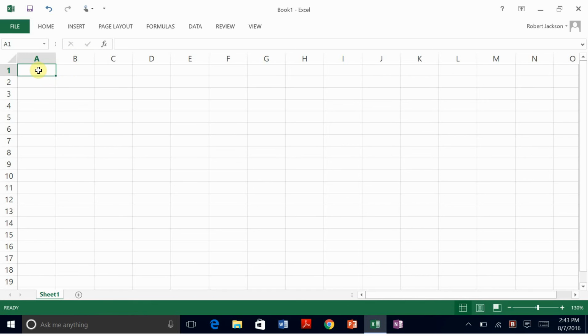Now, for this column, I want my spectroscope readings, so I'll type in that data label. And here will be the wavelengths of the helium lamp. So helium lamp wavelengths, and the units will be nanometers. Now you'll notice that the data labels are overlapping, which is not what I want.